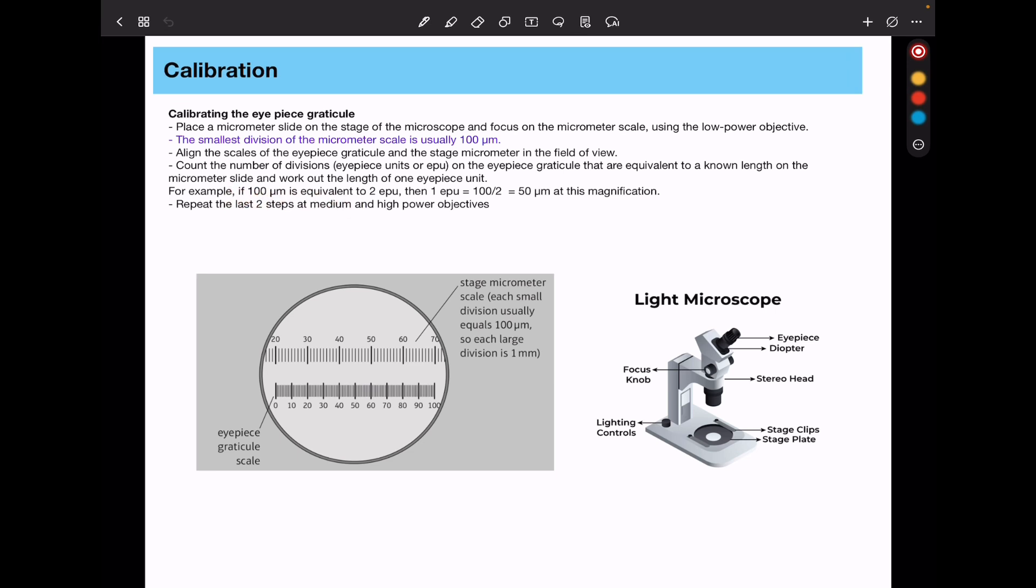The example we have here, if a hundred micrometers is equivalent to two EPUs or two eyepiece units, then it means one eyepiece unit is going to be a hundred divided by two, which is 50 micrometers at that specific magnification. You'll repeat the last two steps at medium and at high power objectives for full calibration to be carried out.